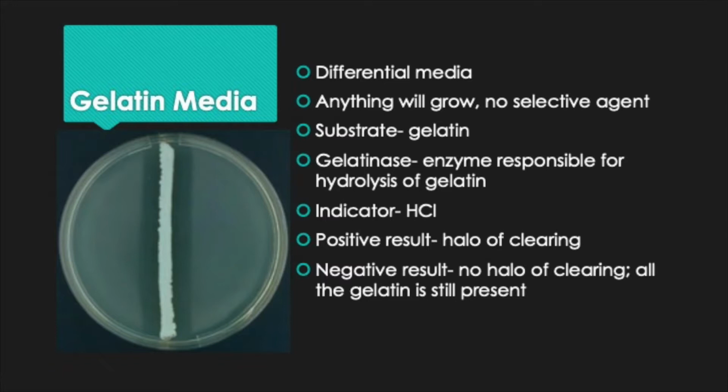Gelatin is the substrate, and we are asking, does the bacteria have the ability to eat the gelatin, yes or no? Basically, does it have the ability to break the gelatin down? If it does, it produces an enzyme called gelatinase.